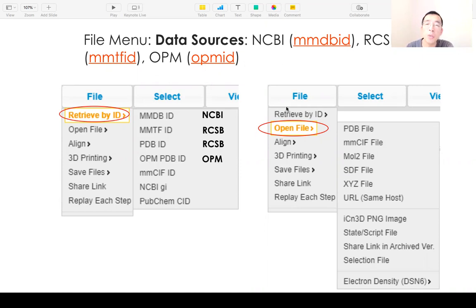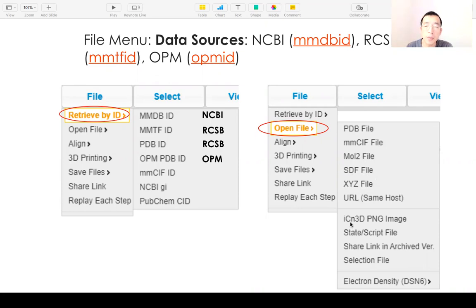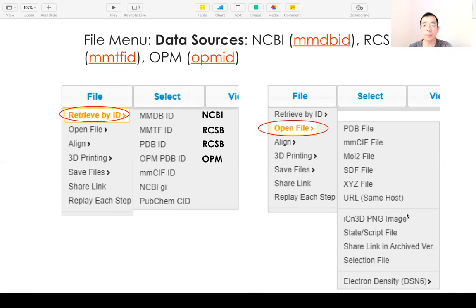You can also load local files: PDB files, mmCIF files, and SDF files. And you can load an iCn3D PNG image or load a state file as well.